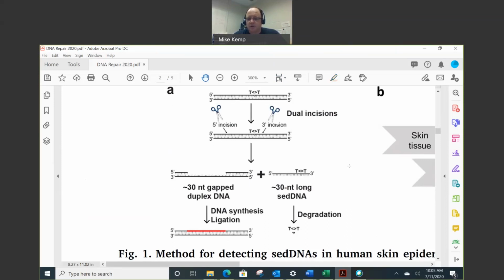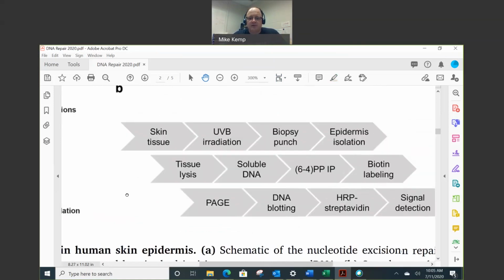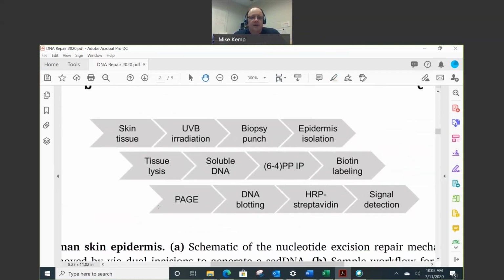Thus far, most of the work that's been done has primarily been in the context of cell culture, which has been very valuable. It's also been studied in mouse tissues in response to cisplatin, but nothing so far looking at human skin. So what Juna and I set out to do was develop this assay to look at that in the context of skin. The basic idea was to use discarded surgical skin, primarily from abdominoplasties, which has been a nice source of skin for these sorts of studies.